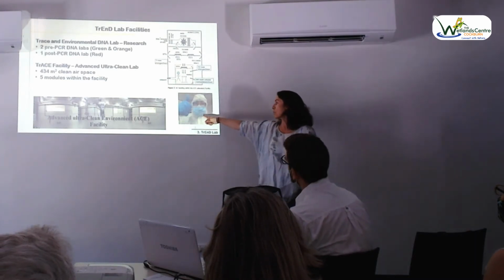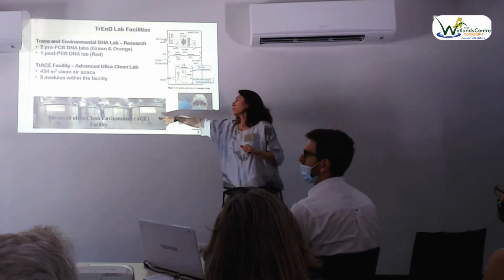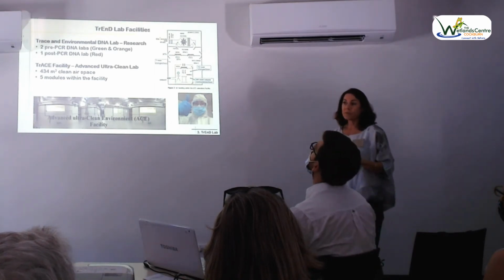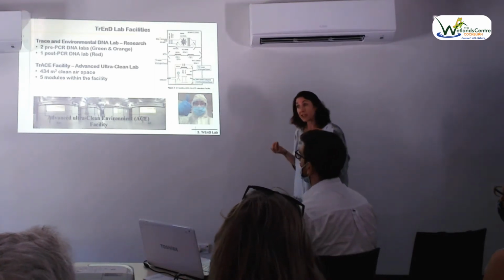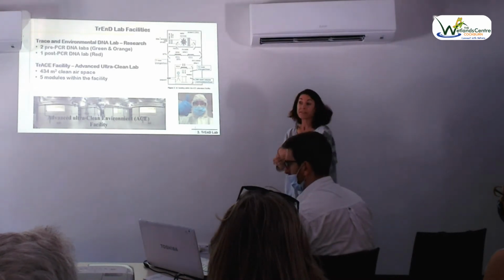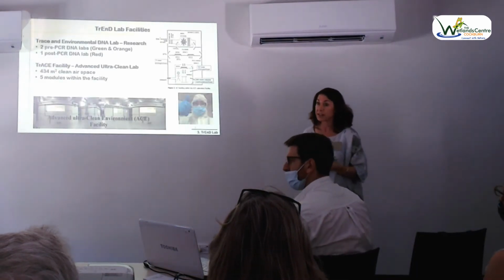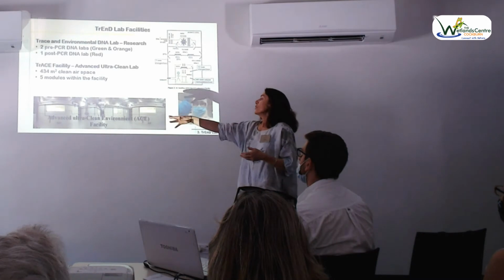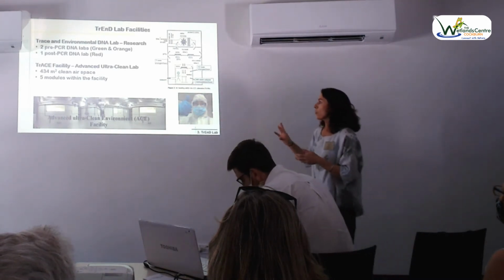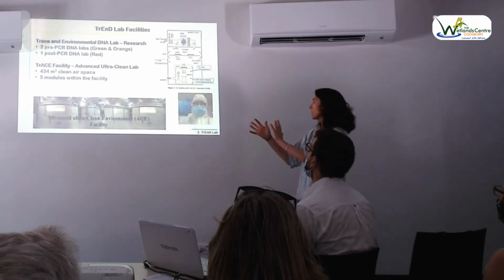So this is me when I go in and work in this environment. We also do ancient DNA work, so our background with environmental DNA comes strongly from ancient DNA, because we work with material that's very old, doesn't have a lot of DNA in it, and is highly subject to contamination. Environmental DNA suited us very well because we already had workflows set up for ancient DNA. It just plugged in.